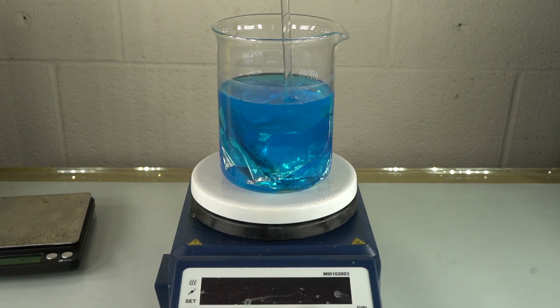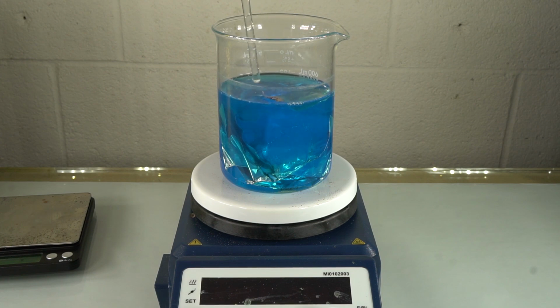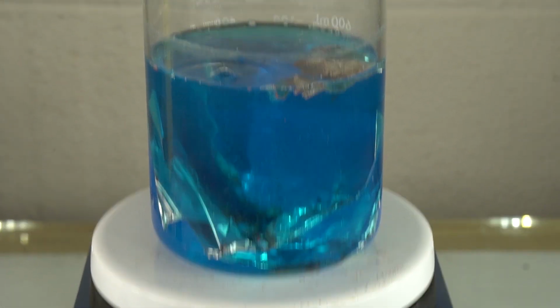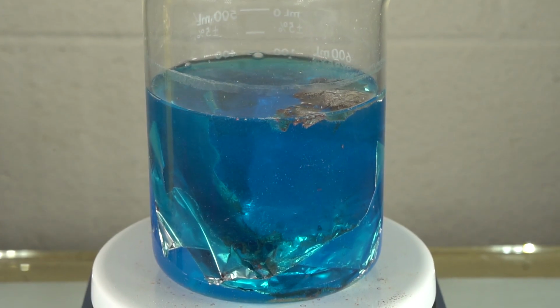And I don't know if you can see, but there's already a good amount of copper forming on the aluminum foil. What it does is the chloride ions, and it's really not fully understood how this works, but it allows the copper ions to somehow bypass and penetrate that aluminum oxide layer, and react. And I'm going to zoom in a little bit so you guys can really see that there's already a good amount of copper forming on top of the aluminum.